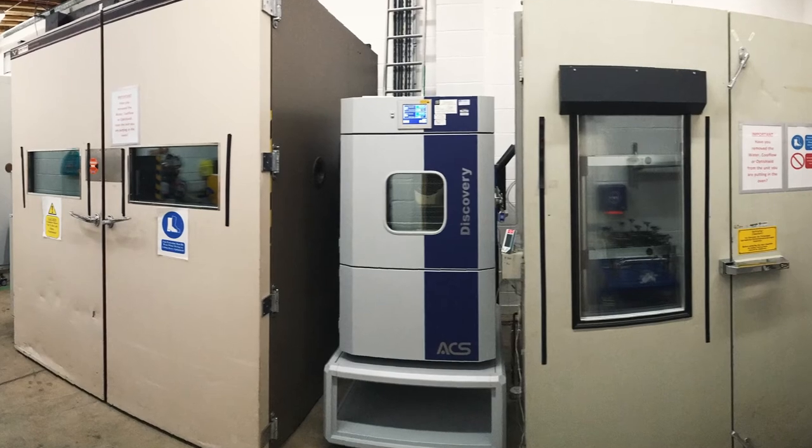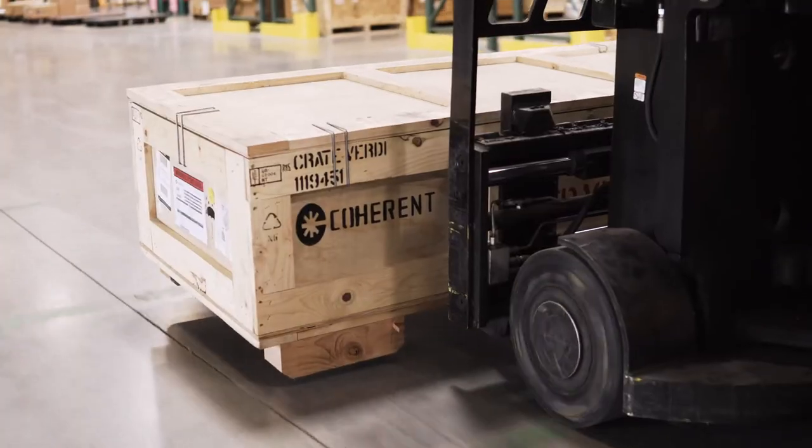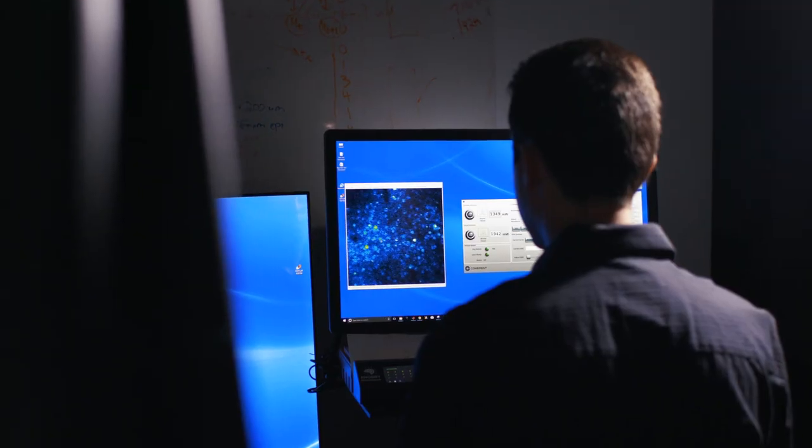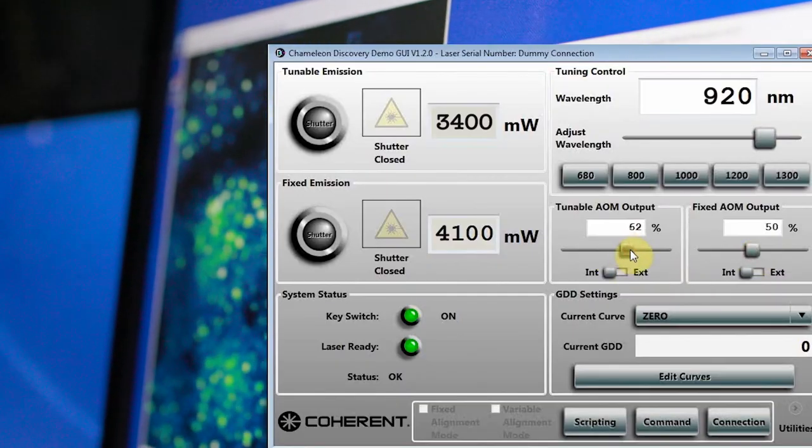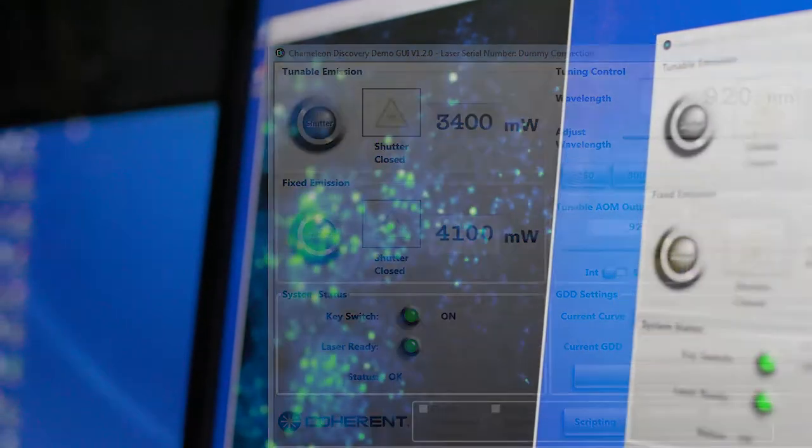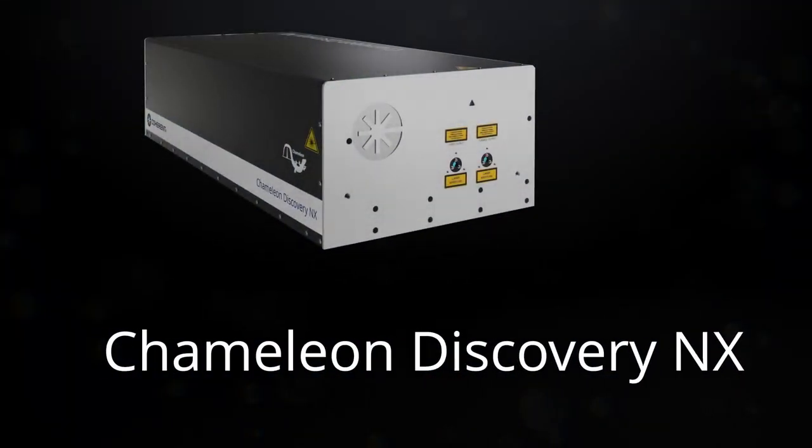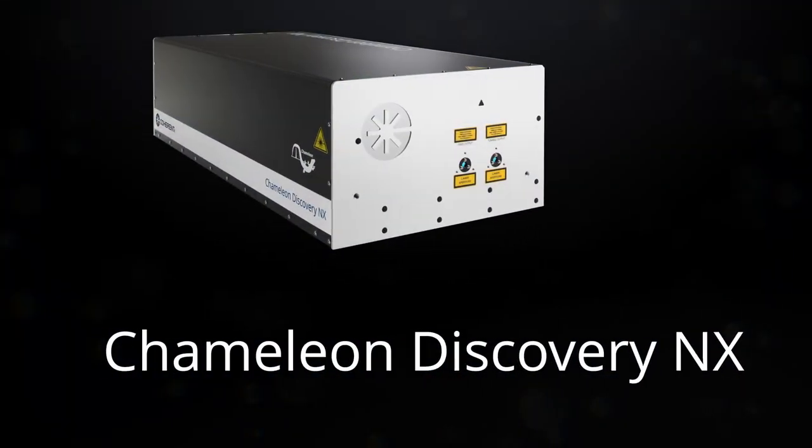This ensures your two-photon laser investment arrives to you in prime condition and reduces any out-of-the-box quality issues. Give your life science applications a brand new image with the latest generation of one-box multi-photon laser sources. Chameleon Discovery NX.